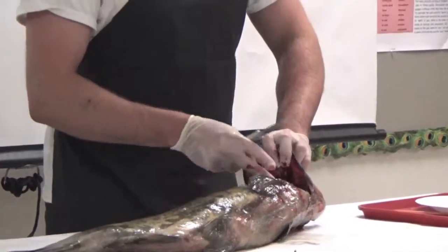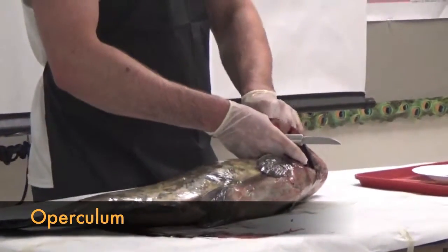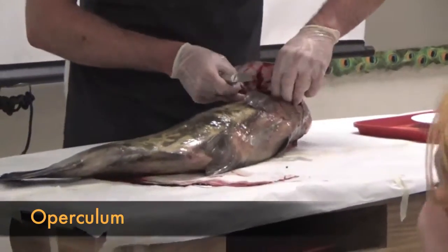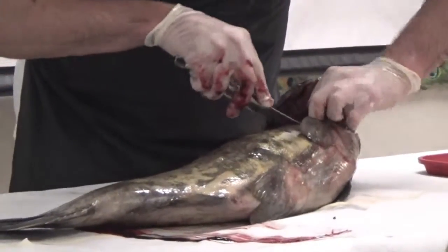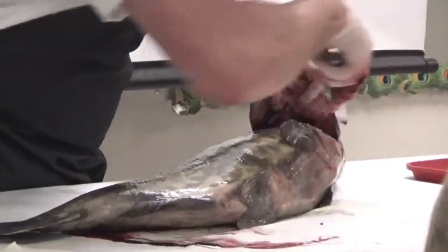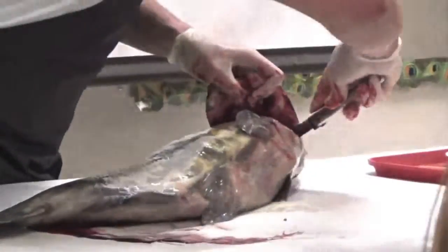Pull back the... What is this organ? This part of the fish is called the operculum. So I want you to come into the operculum. I want you to pull up the gills and then come in. This is where you've got to be really careful because you've got to come in here.